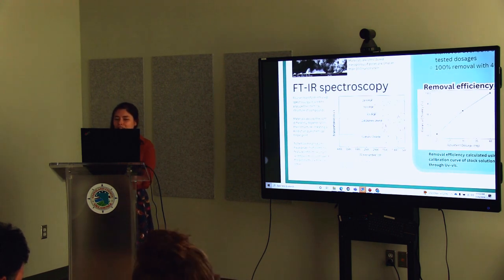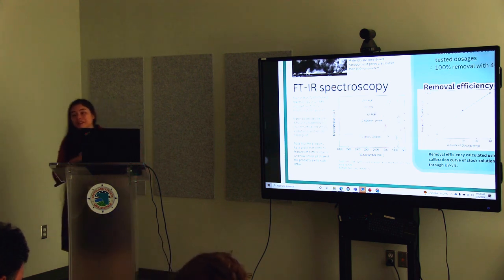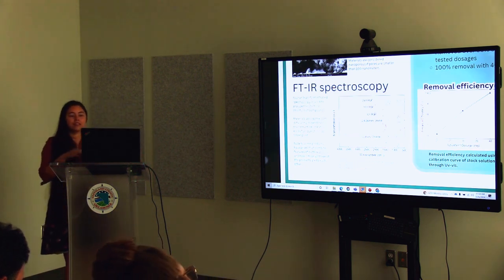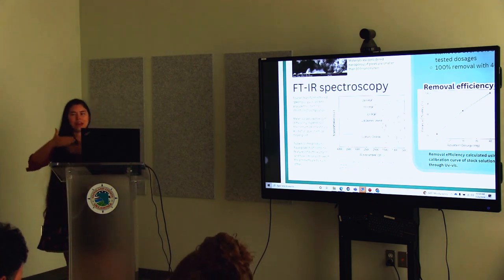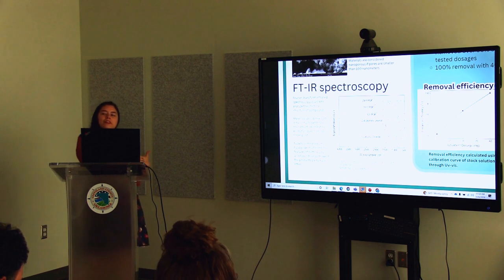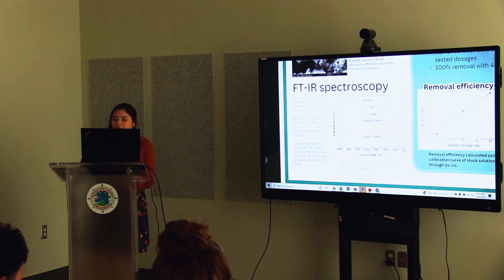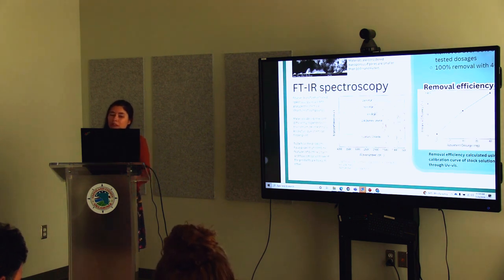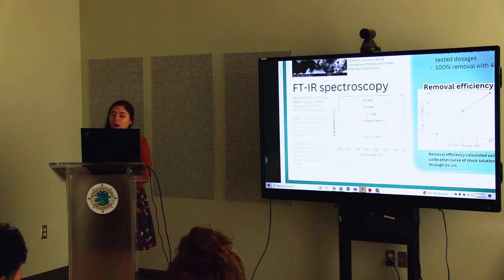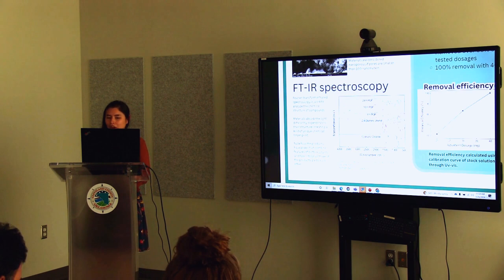And here are our products. You can see we made 3 different versions of the product. We let it run for 8 hours, for 16 hours, and for 24 hours to see if there's any difference in quality, because we're trying to min-max our product, where we have the minimum effort for the maximum results. You can see these 3 top lines look very similar. They have peaks in the same places. The other thing we're looking for is that we do not want our products to look exactly like the reactant. So here, we don't have any peaks here.